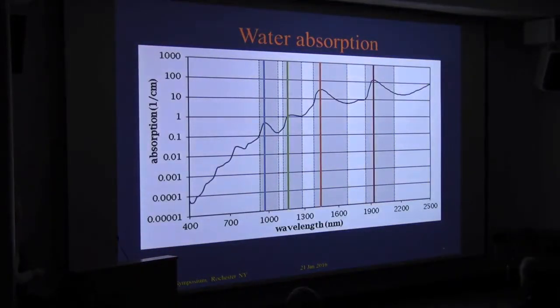Back to the water absorption spectra, it's showing this in a little bit different form. I want to point out that there is a 6-order of magnitude difference in the range of the absorption coefficient from the visible, from the blue range, up to the shortwave infrared. That's a huge range. Things are going to be looking very different depending on which range you're looking at, and what characteristics you're checking. So, I want to point that out and sort of draw some implications from that.